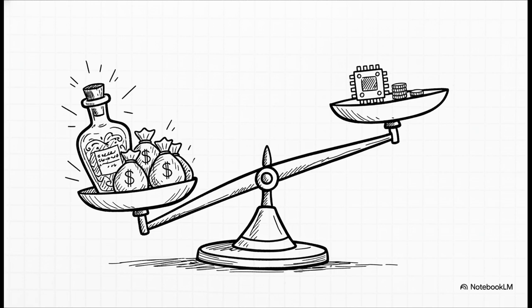And compounding this accuracy problem were the astronomical costs. 454 relied on very, very expensive enzymes like luciferase and ATP sulfurylase. Plus, it required time-consuming wash cycles to clear out those nucleotides one by one. By 2010, running 454 cost around $500 to $1,000 per million reads. Meanwhile, nimble competitors like Illumina were aggressively dropping their prices down to just $10 to $50 per million reads. 454 was simply too expensive and way too error-prone with those homopolymers to survive the market.